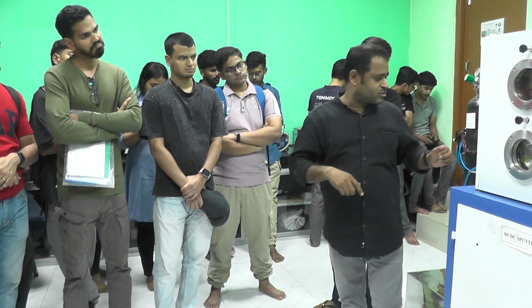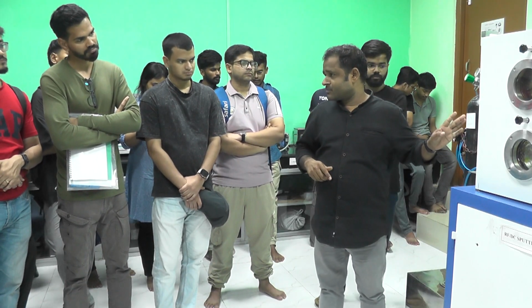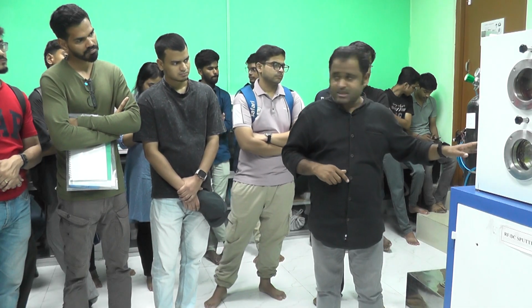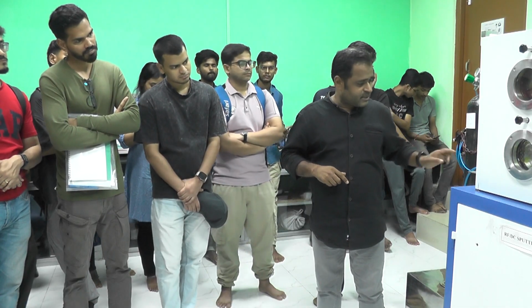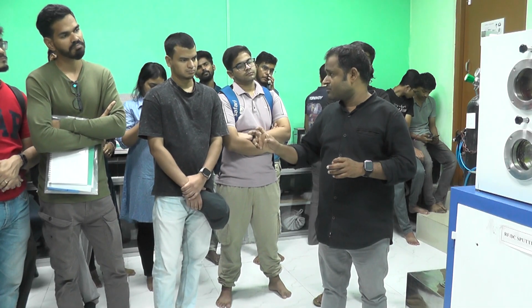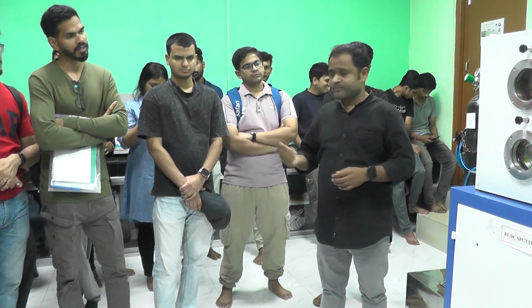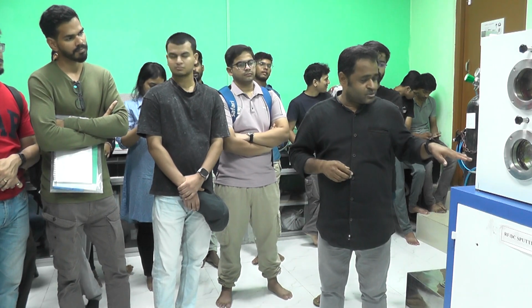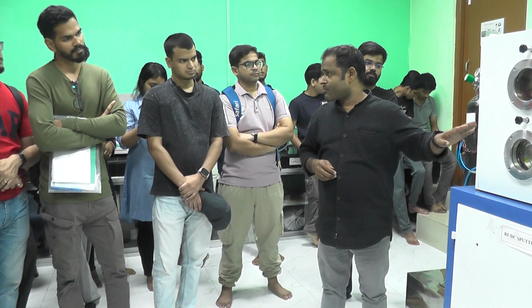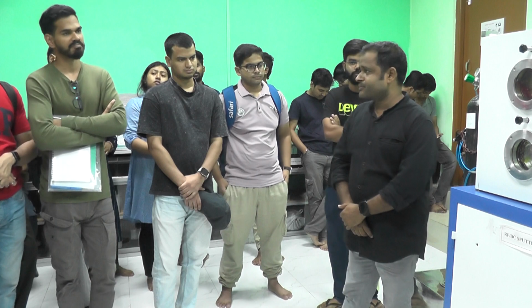Argon has to be passed, and no need to discuss this MFC. With another MFC you pass your nitrogen content with a ratio. You need to know it from the literature, and pass your nitrogen as per the literature. So you can achieve your reactive sputtering.